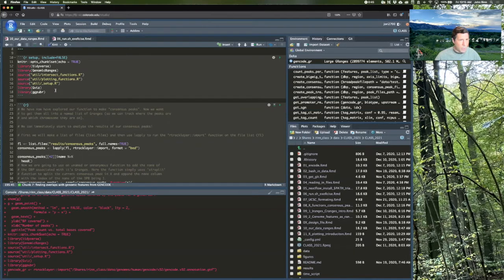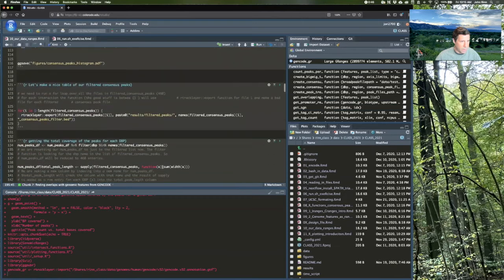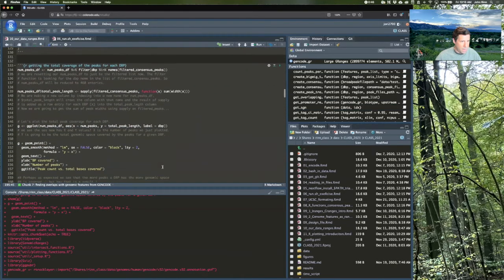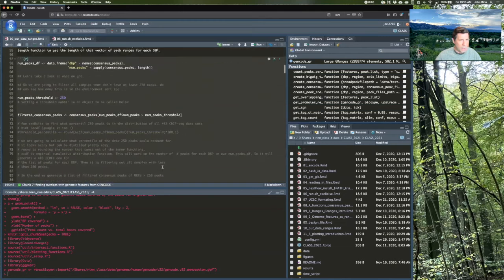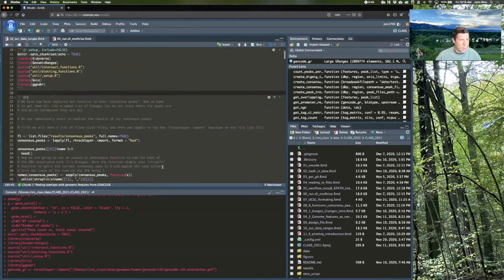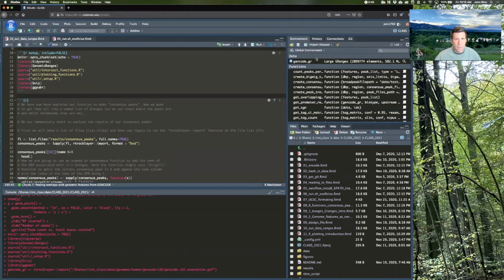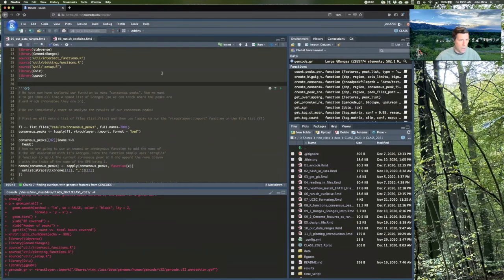We have the libraries we're going to need for today loaded, and I went ahead and loaded GenCode GR. If you want to do that, it's around line 150 something, I believe, where we're going to load it, and it'll take a little while to load. So go ahead and do that now if you want, and it can be running in the meantime.